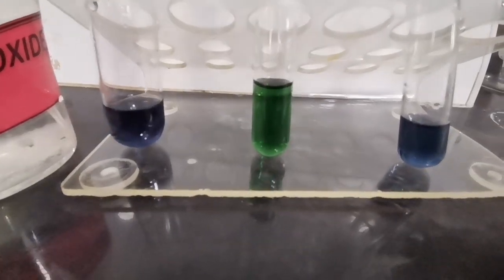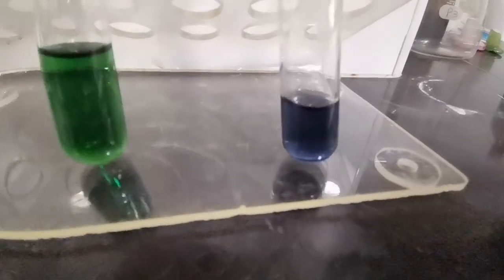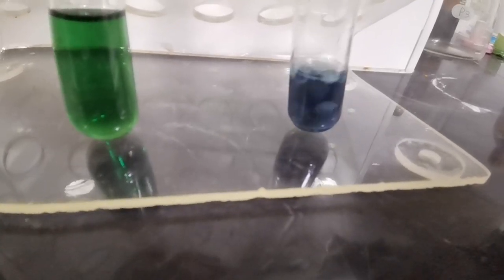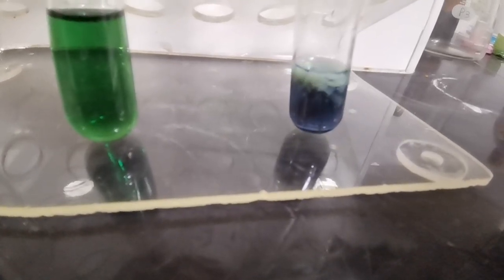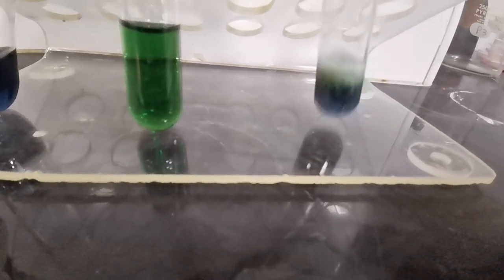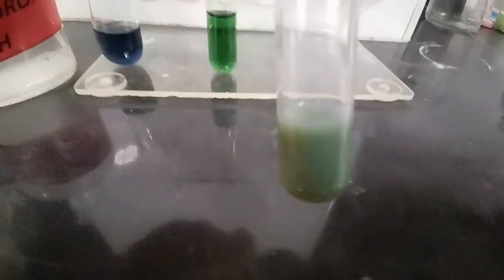Now we repeat the procedure with aqueous ammonia. First we add aqueous ammonia dropwise to our Cr³⁺ positive ion solution, and we see the formation of a green precipitate — this is also sort of a gray-green precipitate.